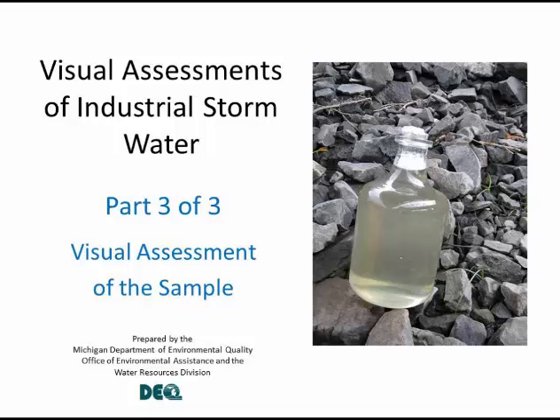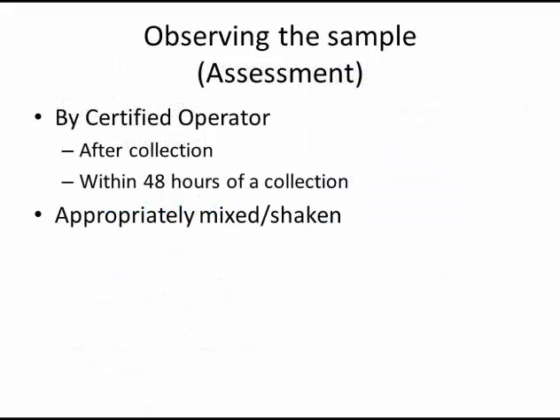Welcome to the tutorial on conducting visual assessments of industrial stormwater discharges. This is part 3 of a 3-part series, and it addresses the subject of the visual assessment of the stormwater sample. A certified operator needs to conduct the visual assessment of the stormwater sample collected at each discharge point. This can be done after the sample is taken to a well-lit area.